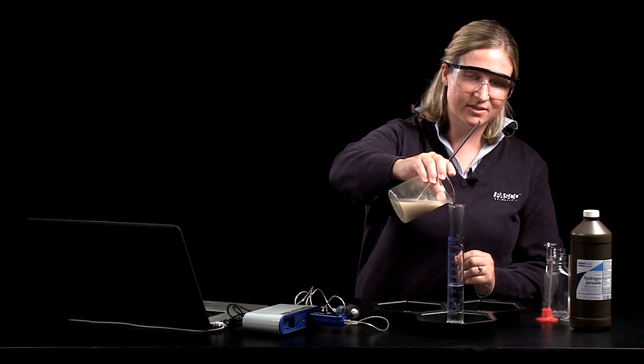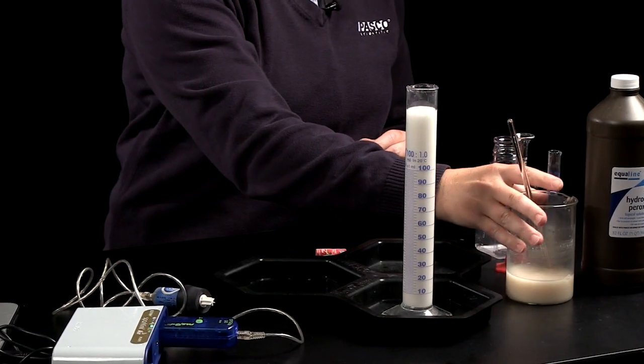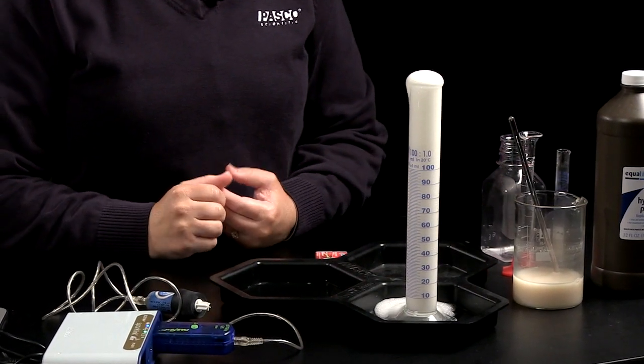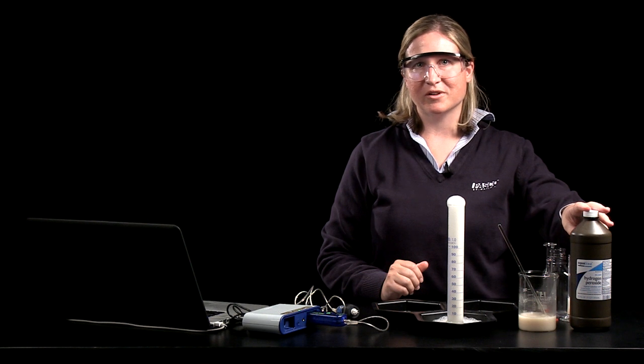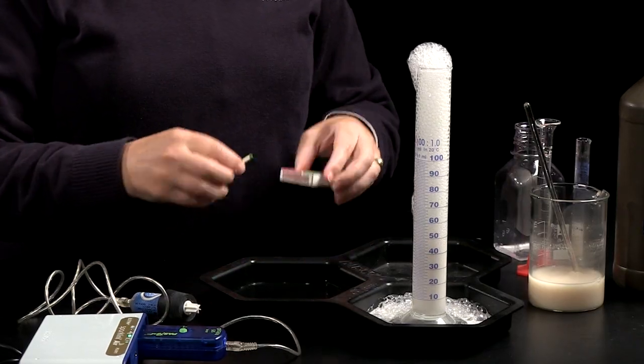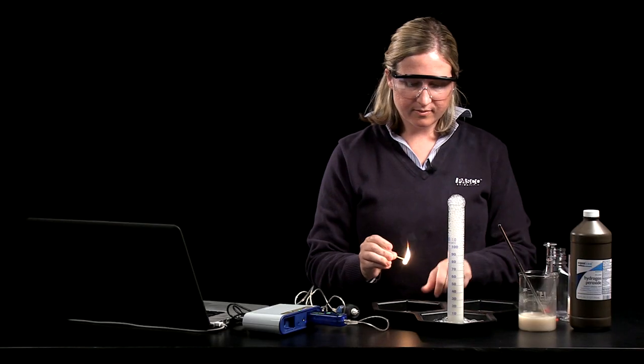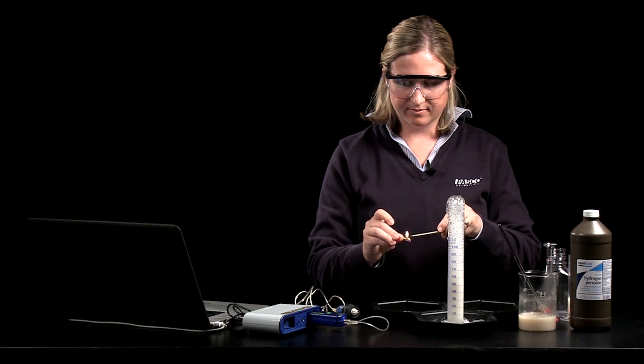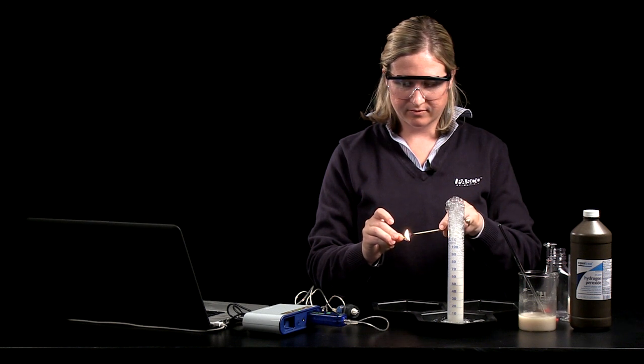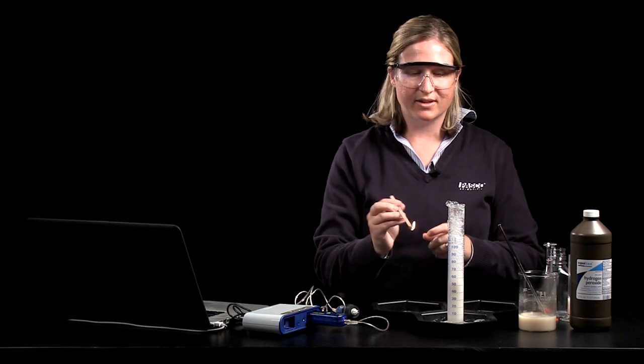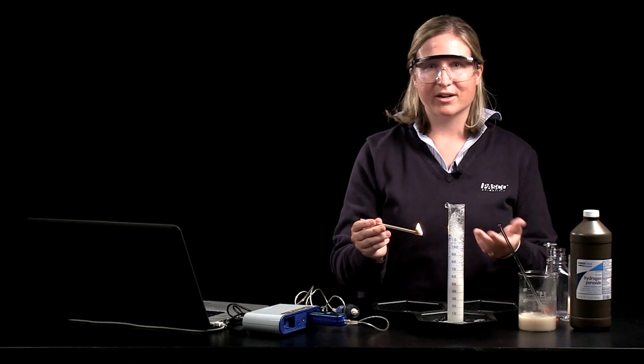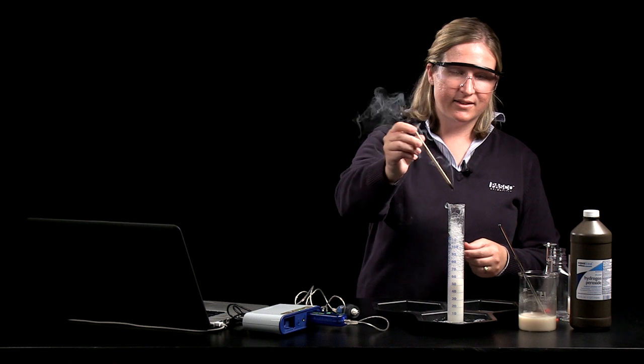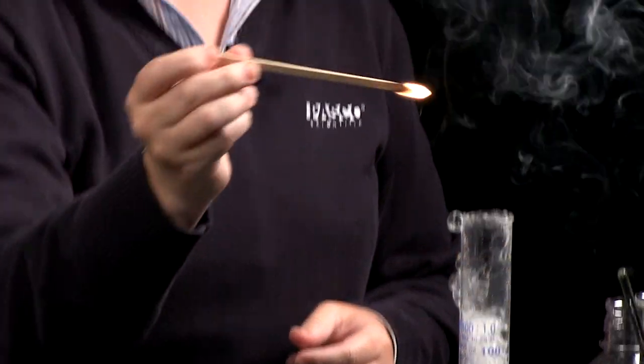So I'm going to add some yeast and the catalase enzyme that's present in those yeast cells takes a slow reaction. The hydrogen peroxide would decompose on its own just very slowly but with the enzyme present the reaction happens much more quickly. I'm going to light a wooden splint and perform an oxygen test with the gas that was produced. So students should be able to tell you that one of the products produced in the reaction is a gas and then you can use the flame test to demonstrate that that gas is oxygen.